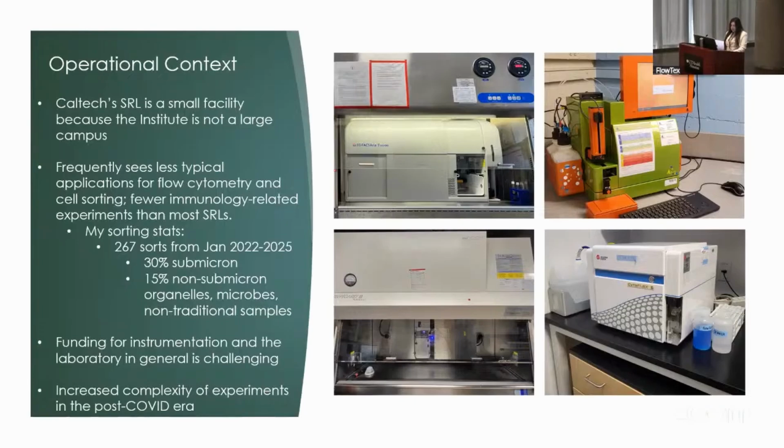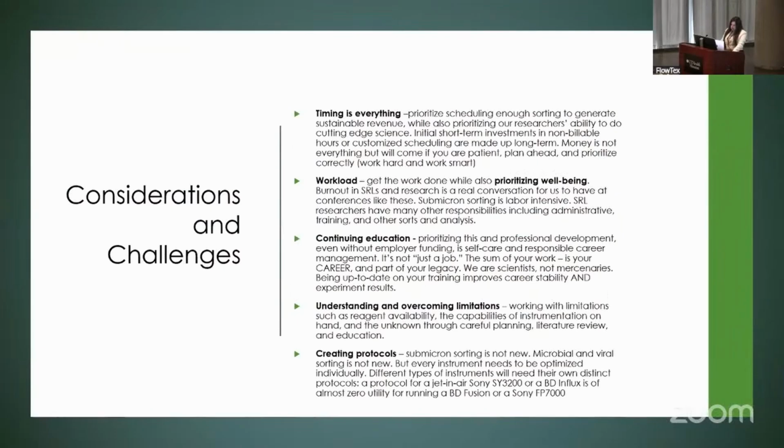All right, so finally, some considerations and challenges. Mindful scheduling has always been really important to make sure everyone gets their work done and to minimize the downtime for cleaning. But scheduling in an SRL isn't just about time management. It's also about balancing unpredictable or novel experiments, instrumentation doing its thing, as we said, DIVA, and of course, operator workload.